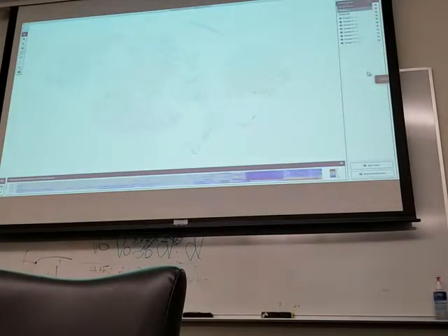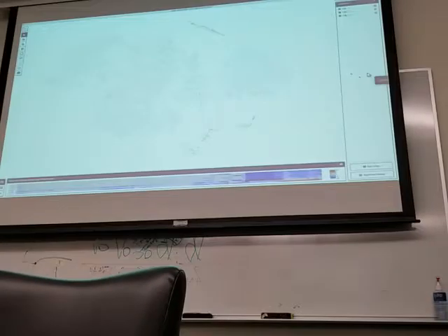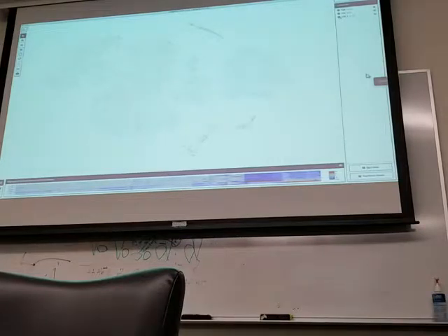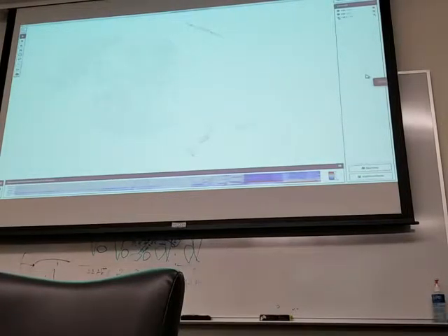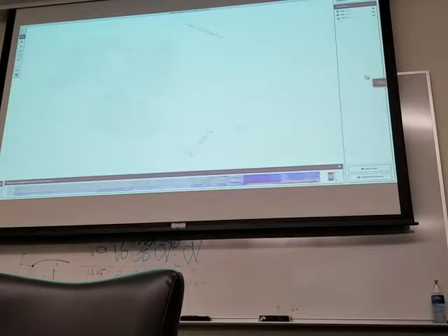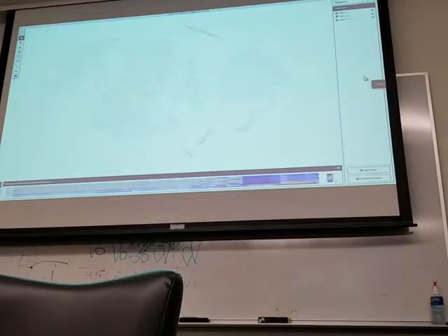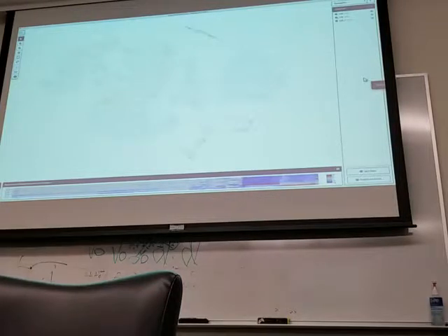So if we pull up the library ID, we do still see some of the separation here. Specifically, sample 135 is very separated. So the ones that are flashing on and off there are 135. Those are a bit more separated from the other two samples.